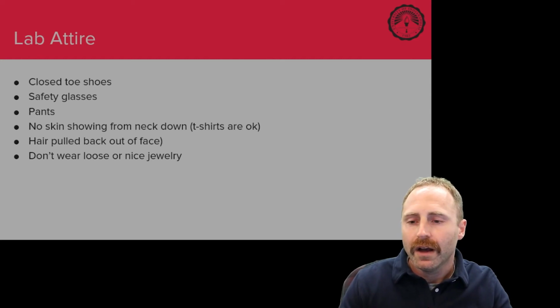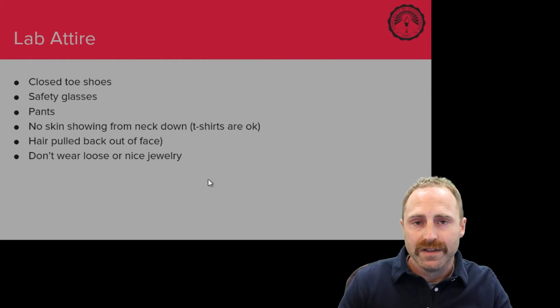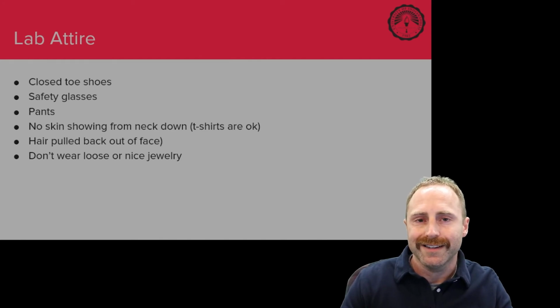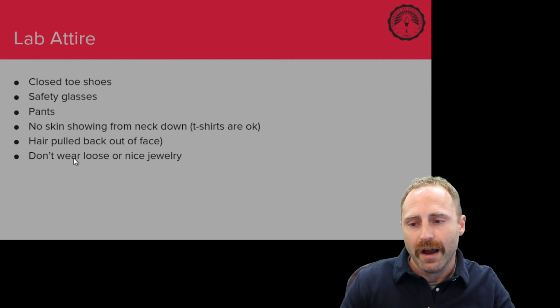Flip-flops are bad. If it's not a closed-toed shoe, you are subject to being sent home and then not being able to do said lab, because as it states in the syllabus, we will not be doing makeup labs this semester. And so failing to show up to the laboratory assignment for your face-to-face lab, and failing to show up in the appropriate attire, will result in a 0 for the assignment. So make sure you're wearing the right stuff.